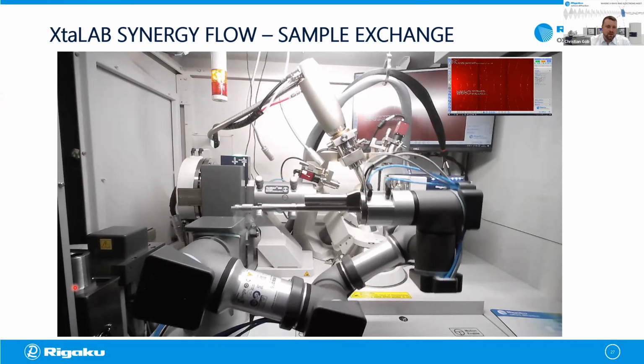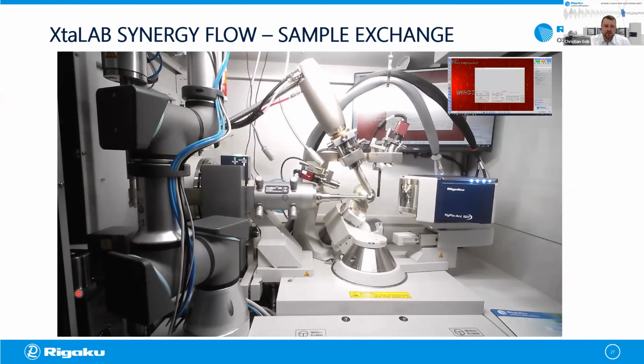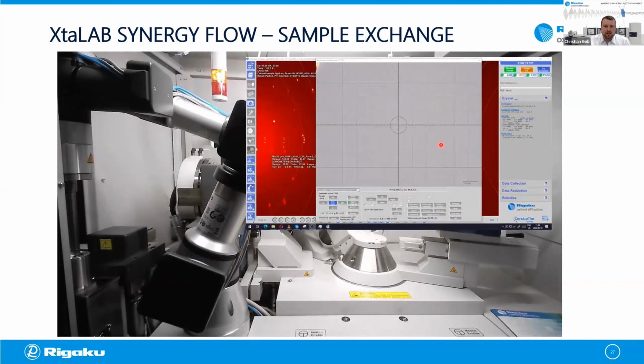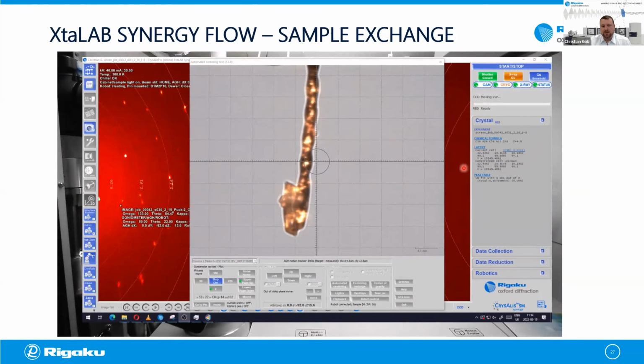The robotic arm will now have to warm up this end effector. It will go into this position here. Here is a small heater device that will warm up the robotic arm. In the meanwhile, the measurement starts. I will just increase this overlay window so you see how the sample is centered.